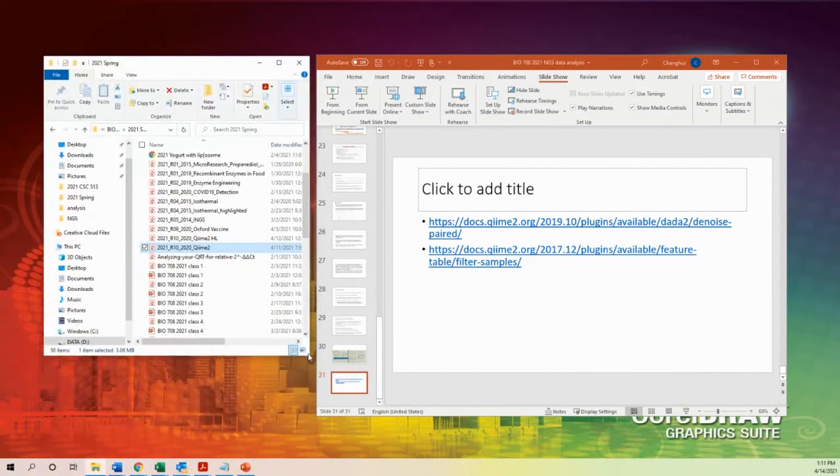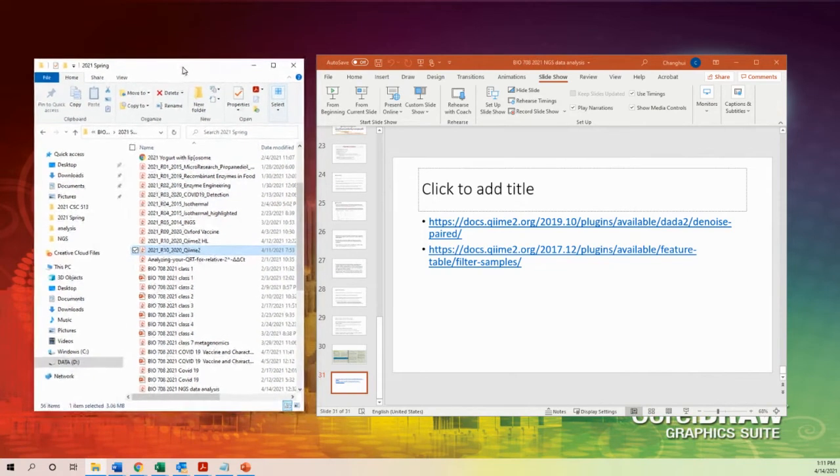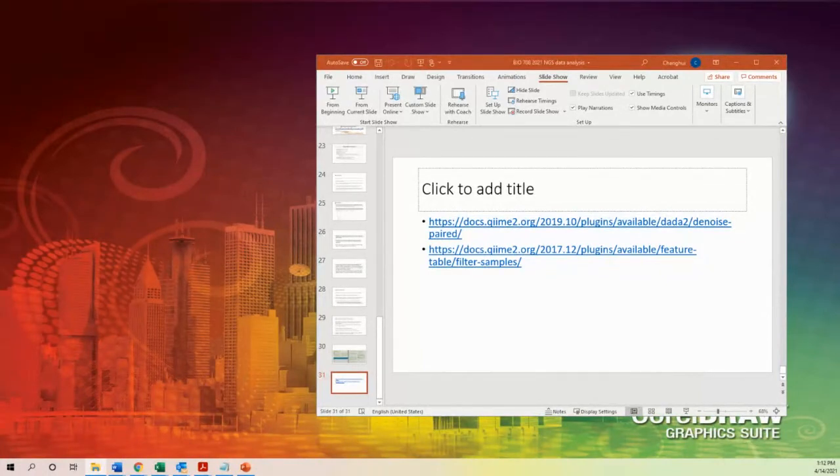First of all, we will start the process. I want to know if you can download the Oracle VirtualBox and the QIIME tool now. Can you download these two files now? Professor, I've already downloaded both of them. Okay, good, very good. Me too, Professor, I already downloaded. You downloaded, very good. Okay, let me see.